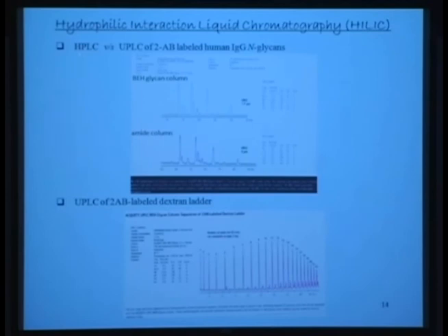So high pressure or high performance, whatever you want to call it, versus ultra high. The pressure dramatically increases. Typically, in HPLC there is a micron dimension for the matrix. The matrix typically has 5 micron size or higher. UPLC is about 1.7 micron diameter particles. So these are really, really fine particles, and because of that, the absorption characteristics increase dramatically.